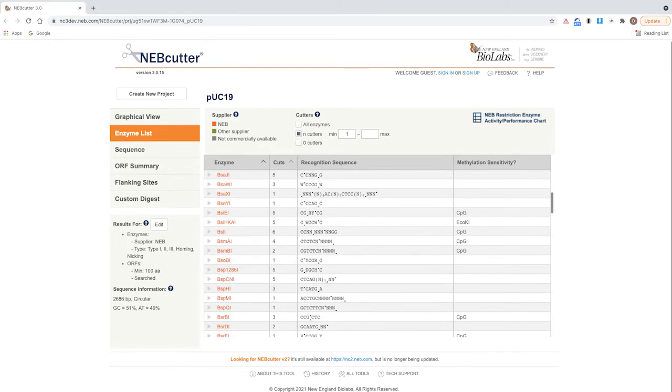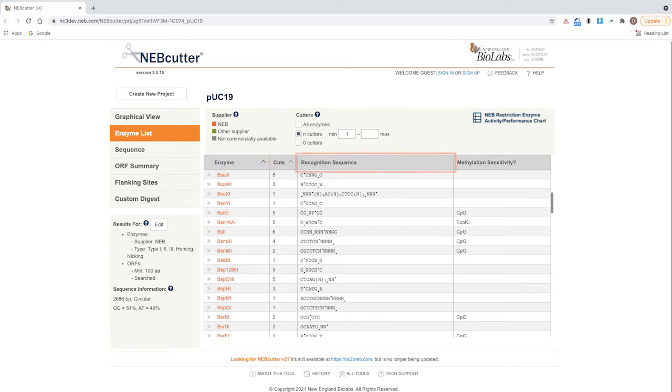This feature provides a list of all the restriction enzymes that will cut the DNA, number of recognition sites, recognition sequence of enzyme, and enzyme activity in all four NEB buffers.